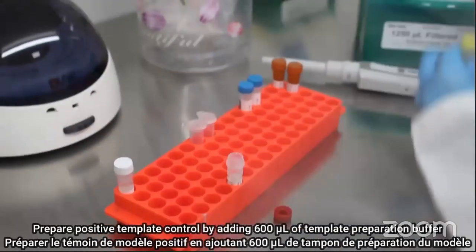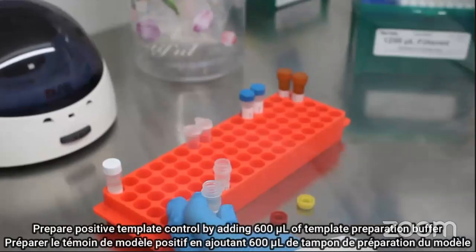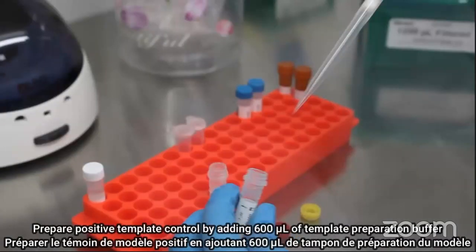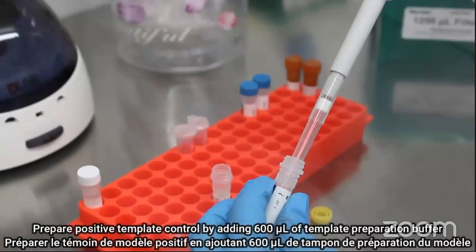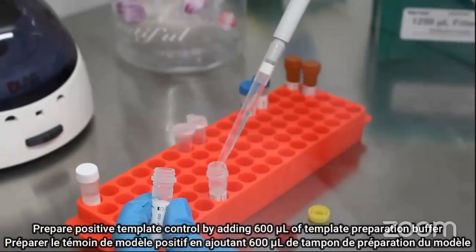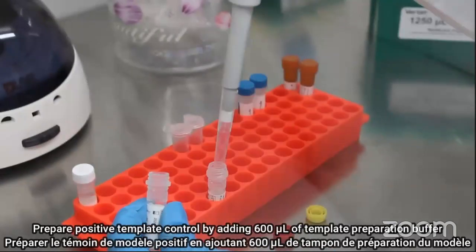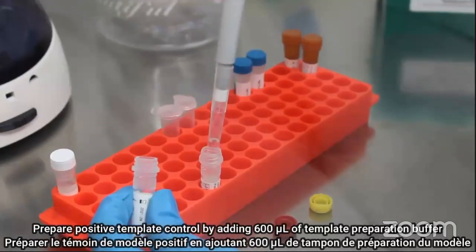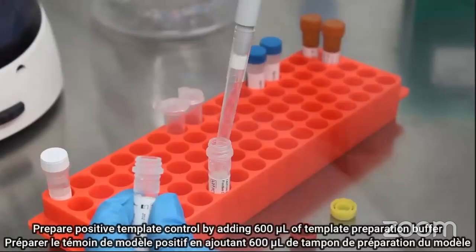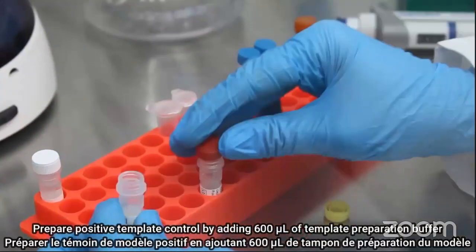You have to be careful while making the PCT because it can result in cross-contamination. As mentioned earlier, it has a high template concentration, so we have to be really careful. Discard the tip really carefully without passing over the top of any of the tubes. You have to be really careful in handling this and be very gentle and slow.